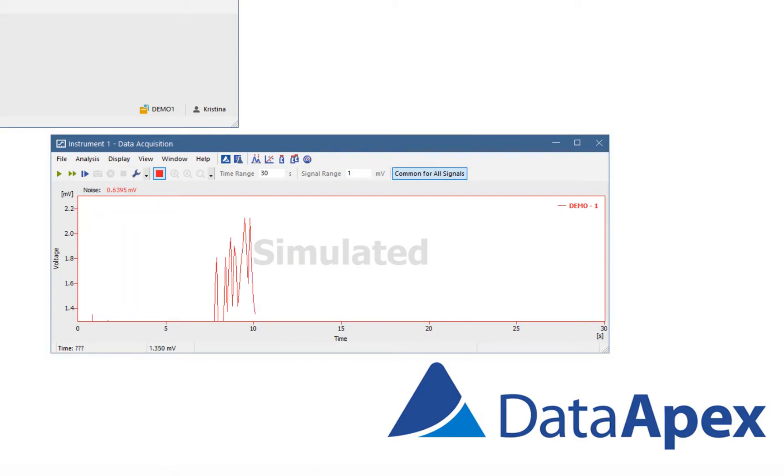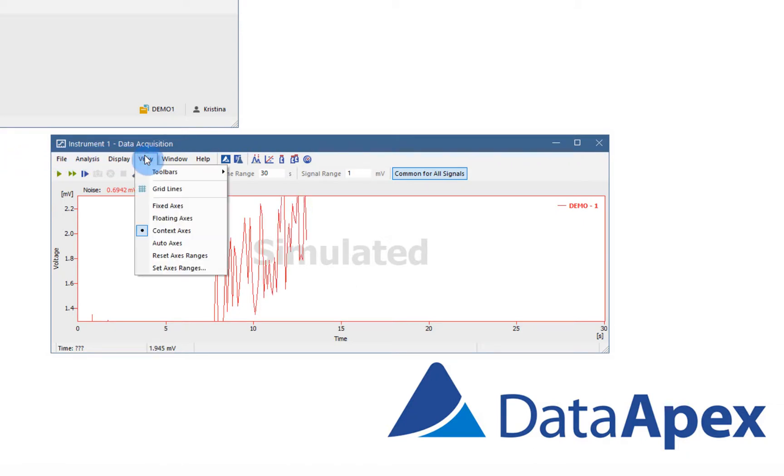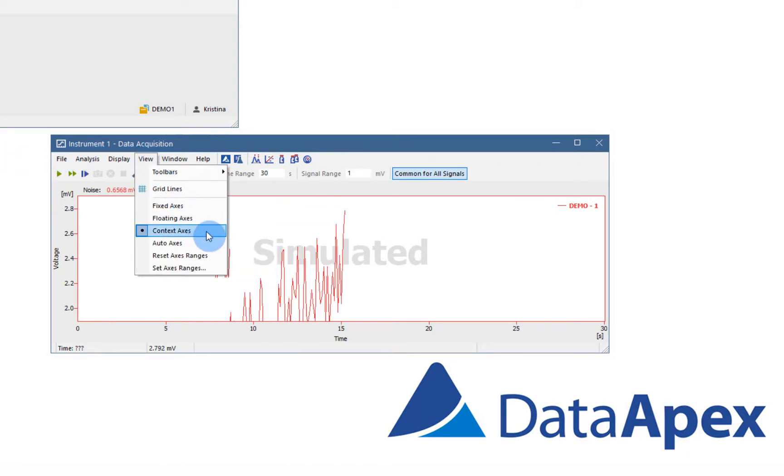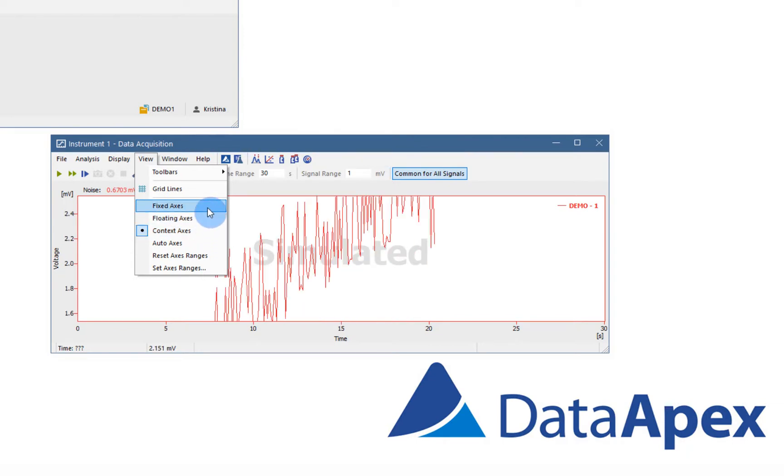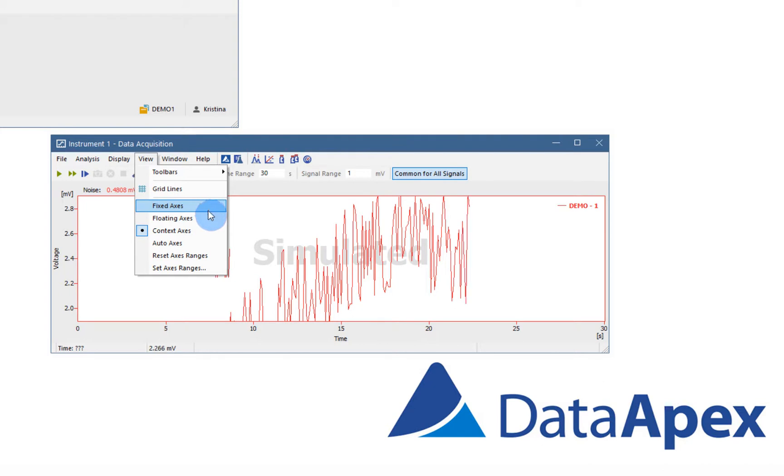When watching real-time signal, you can use different views. Default view is the context axis, which automatically switches between floating and fixed axis depending whether the instrument is running.